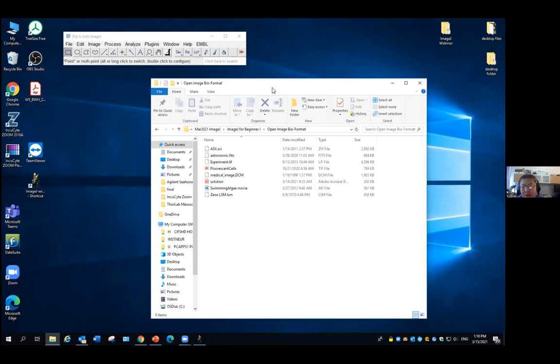Here I just show you some examples. If you go to the bottom one, that's the Zeiss LSM. If you're doing confocal using the Zeiss system, a few years ago, the confocal format was .lsm. To open the image, you just directly drag it into the ImageJ main menu.